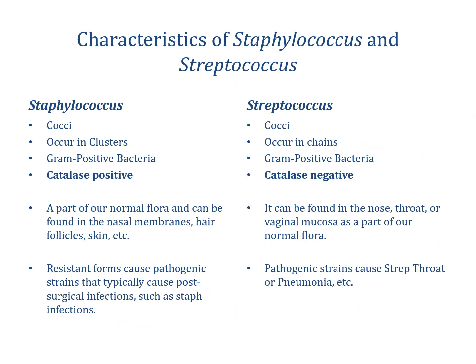So number 2 of differentiation of Staphylococcus species asks about the 2 places where Staphylococcus aureus would normally be found. This can be found in your normal flora, like the nasal membranes or on the skin. And how do we differentiate between Staphylococcus aureus and Staphylococcus epidermidis?